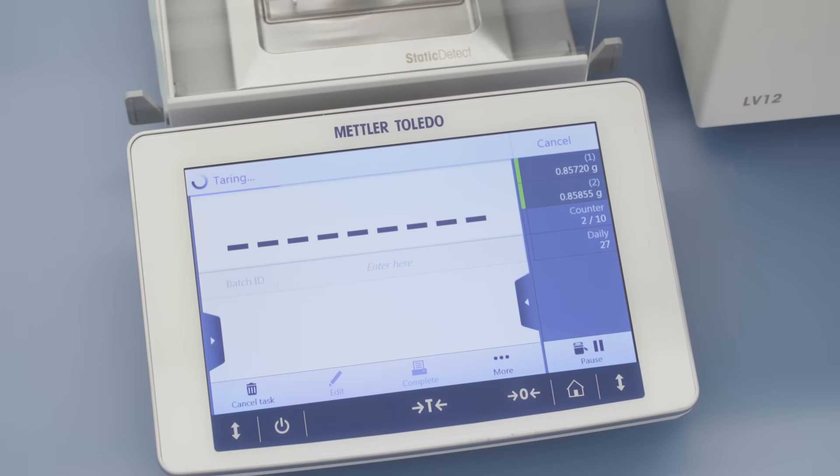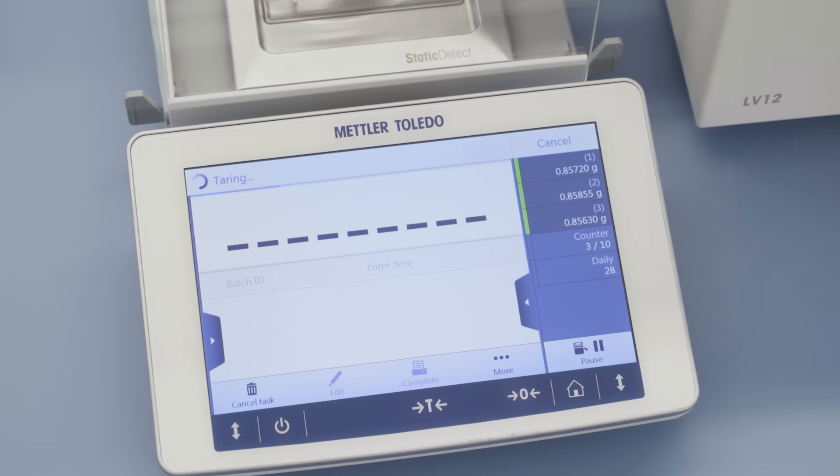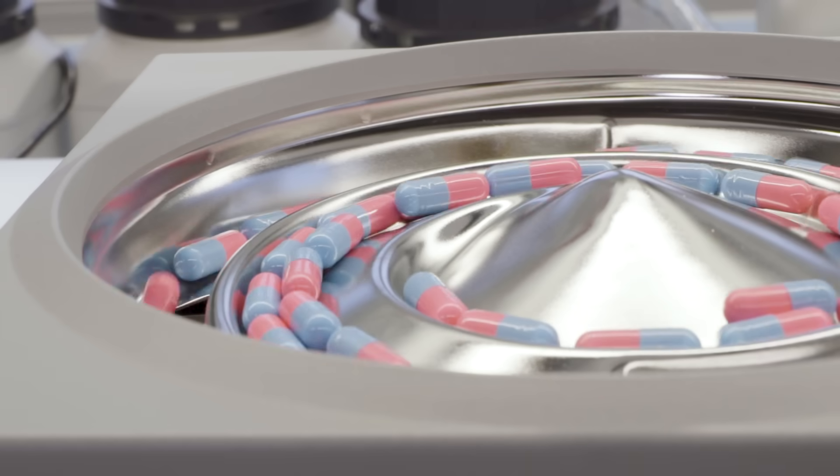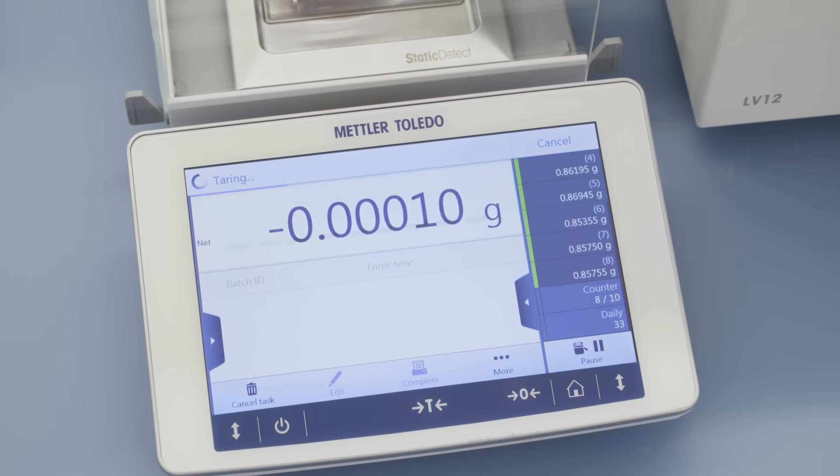The specimens are released one at a time into the container on the balance. The balance captures the weight and tares automatically. Each weight result is displayed on the screen and stored in the results notepad.